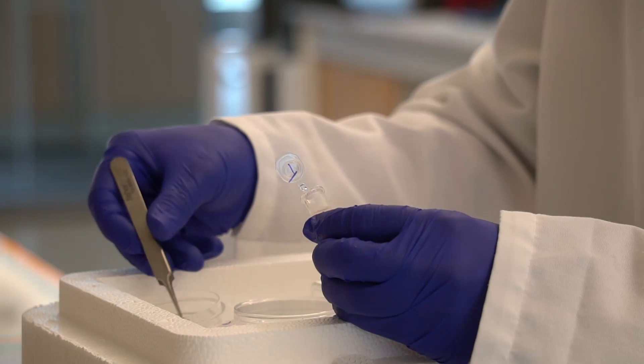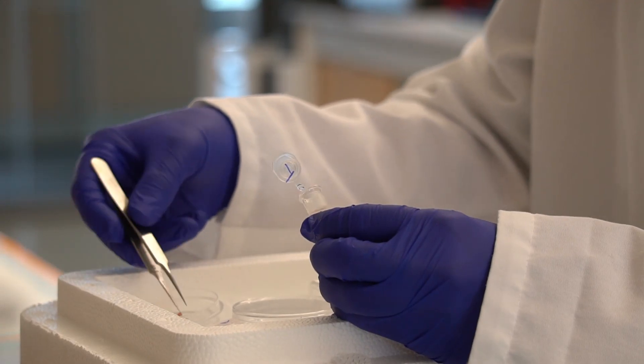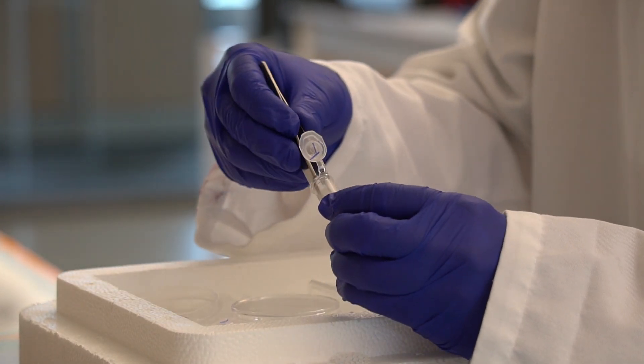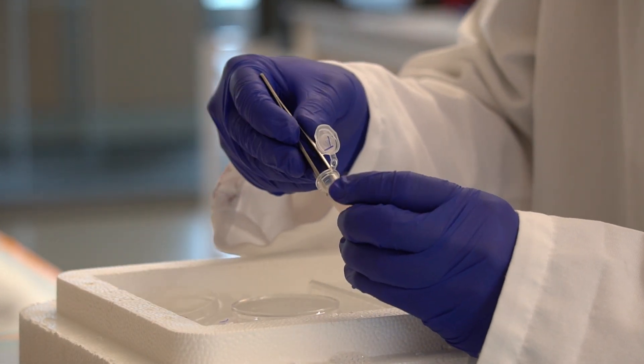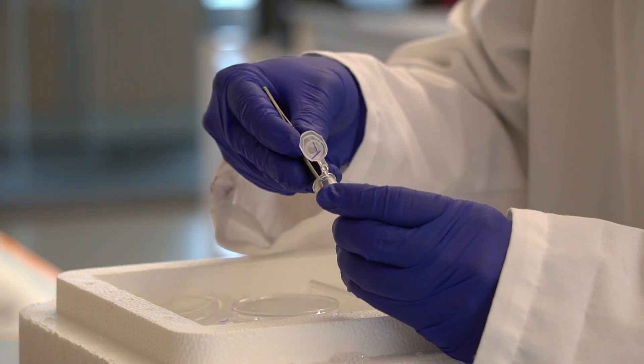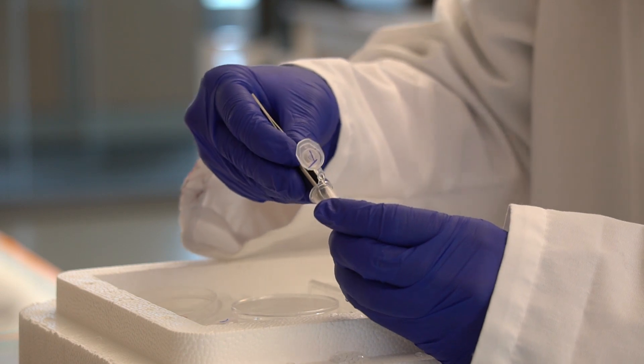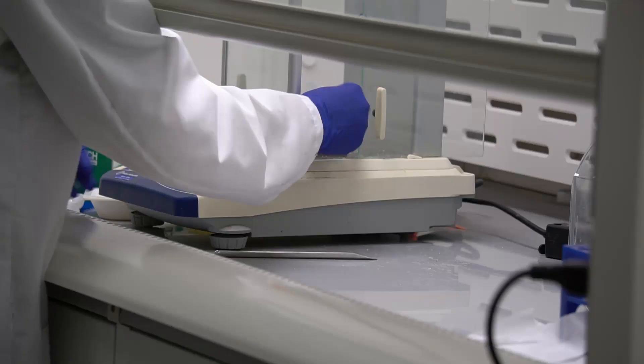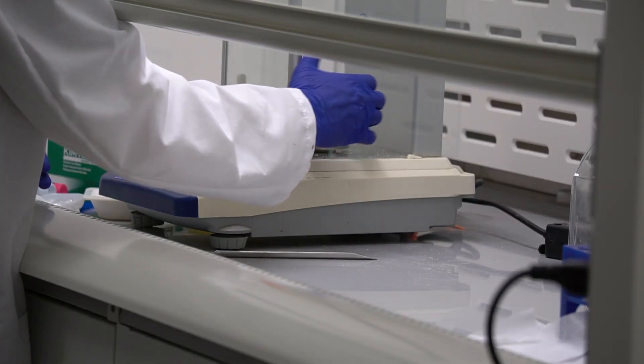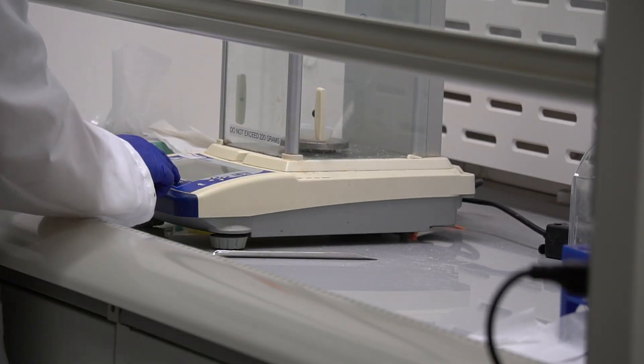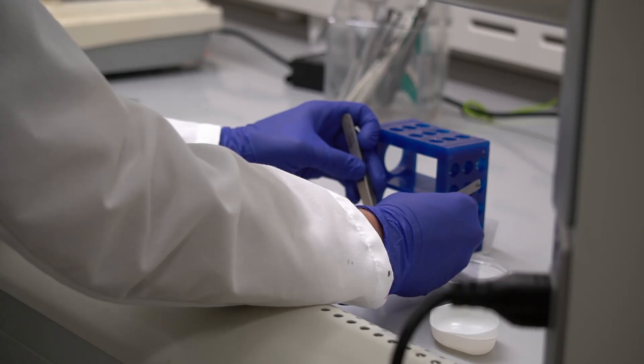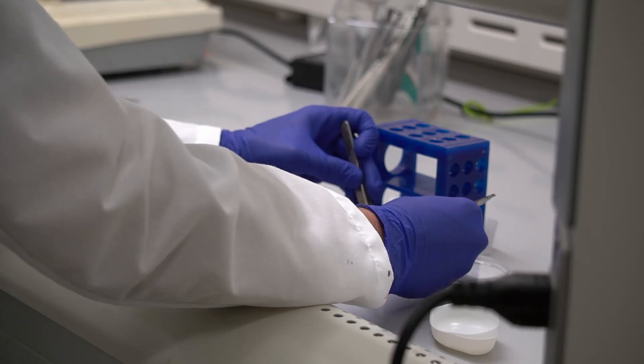Once the plate of media is ready, we can go ahead and cut the PVAT into equivalent parts. Each piece is weighed and then divided. This way, we can make sure that each experimental group receives an equivalent mass of PVAT.